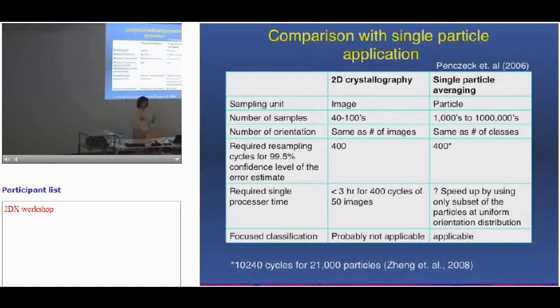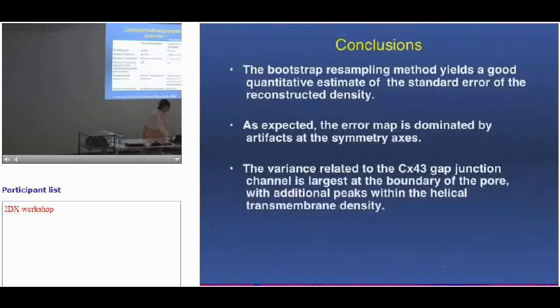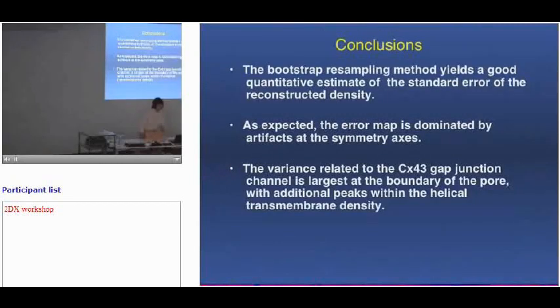In other words, using the variance and covariance information to mask out regions that don't change. Then you're able to classify different conformations within the range where you have the biggest variance. This unfortunately probably won't work in 2D crystallography because of the overlapping of the density in the crystal. But there's still a possibility that you can use it, so you should keep that in mind.